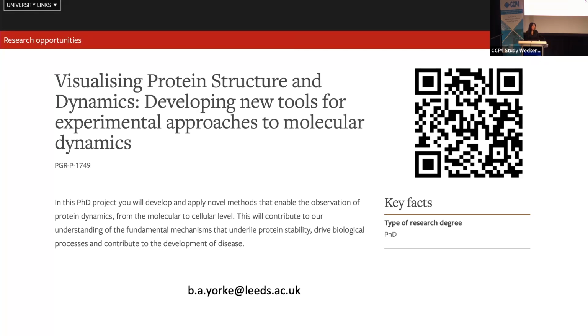Is there any way, and if so how, to deconvolute the differences between individual molecules in the asymmetric unit and the real shift in structures due to real proper change? Yeah, we hope so.